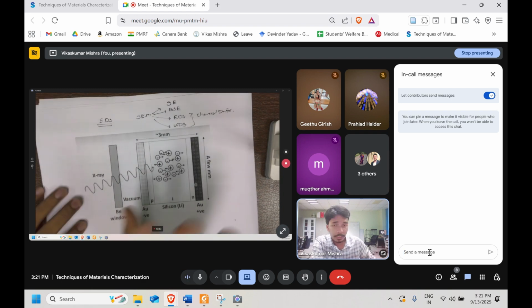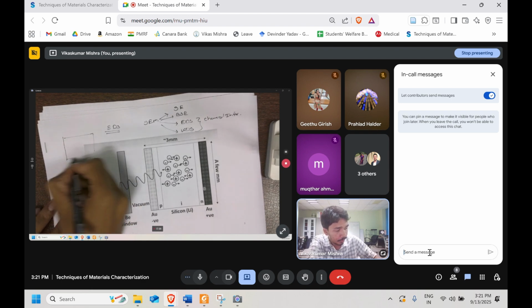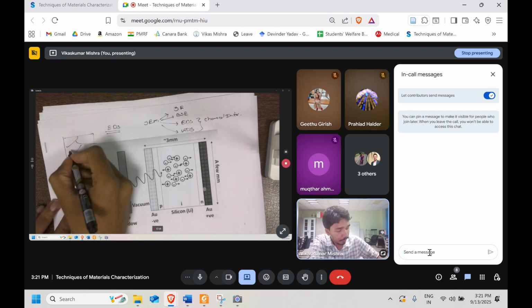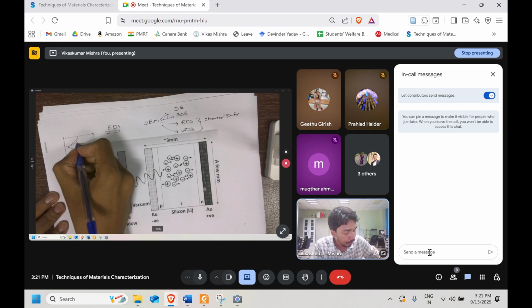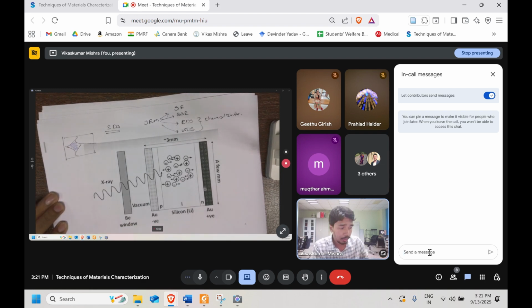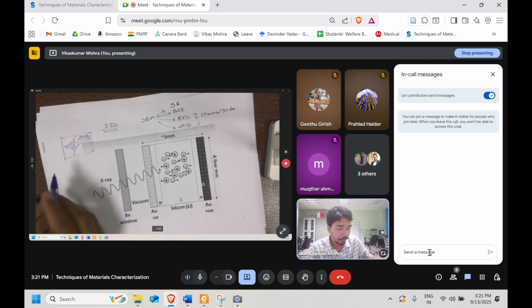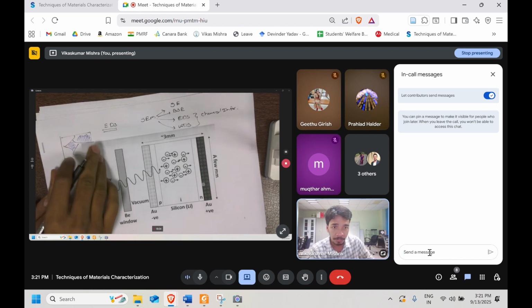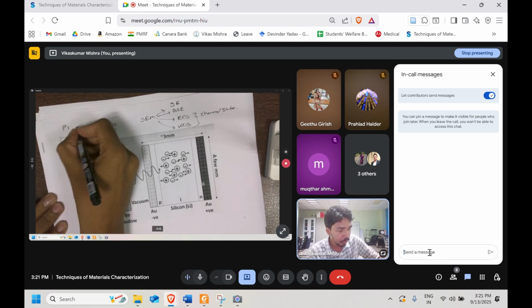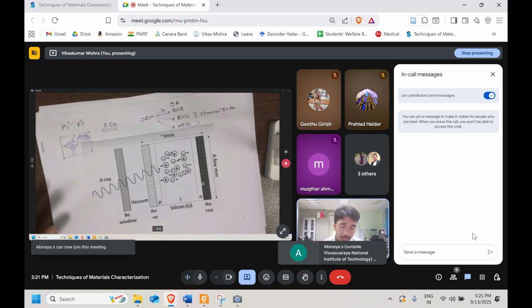Okay, so for example, let's see why it is very important to us. Let's say you had a specimen with you, having this particular type of microstructure, and let's say that this particular phase is different. These particular phases, the blue color ones, are different from the one which is not shaded. Okay. If you did the XRD, you will only get to know that in this particular material, phase one and phase two are present. These two particular phases are present.